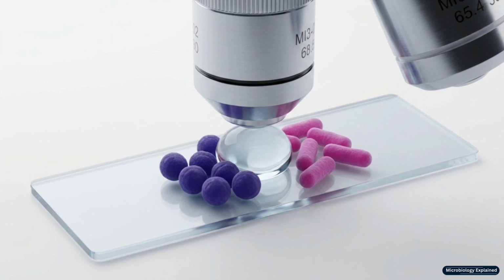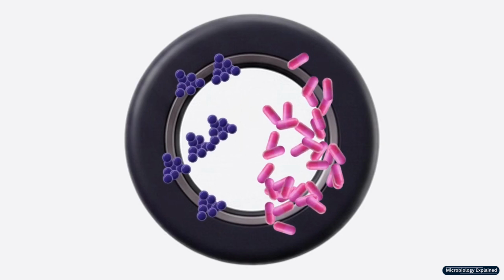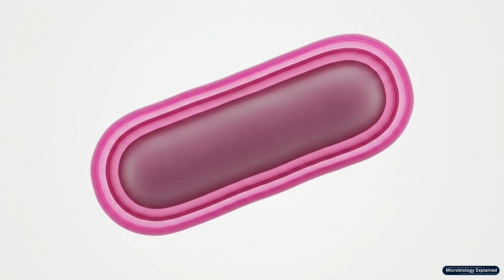If we stained a mixed sample correctly, the visual division is stark. We can clearly distinguish the deep purple spherical bacteria from the bright pink rod-shaped ones sharing the same space. Those colors tell us exactly what we are dealing with physically. The purple cells have the thick peptidoglycan armor, while the pink cells rely on their thin walls and lipid membranes.